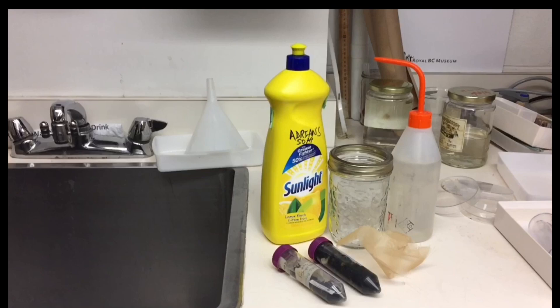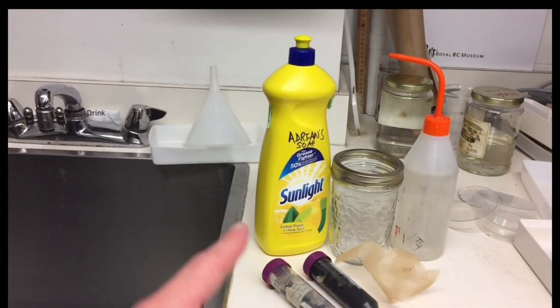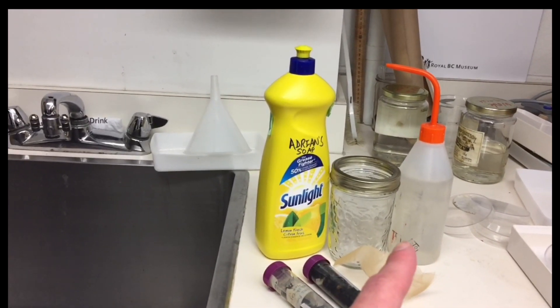Cleaning bumble bees is easily done using common household materials. Basically you just need something like Sunlight dish soap, a canning jar, and a spray bottle with some 70% alcohol.